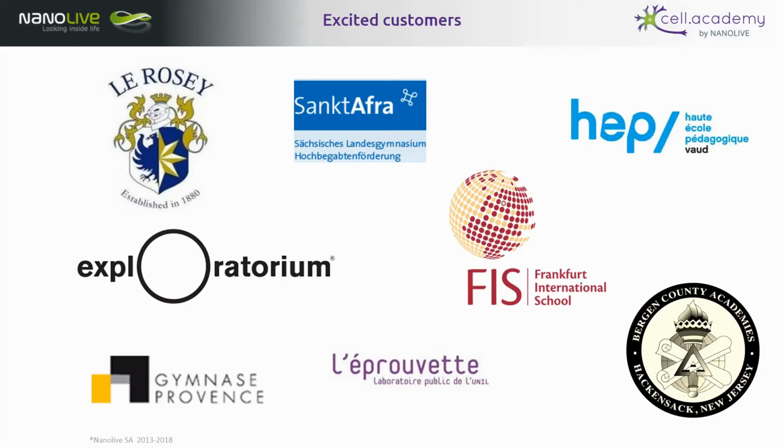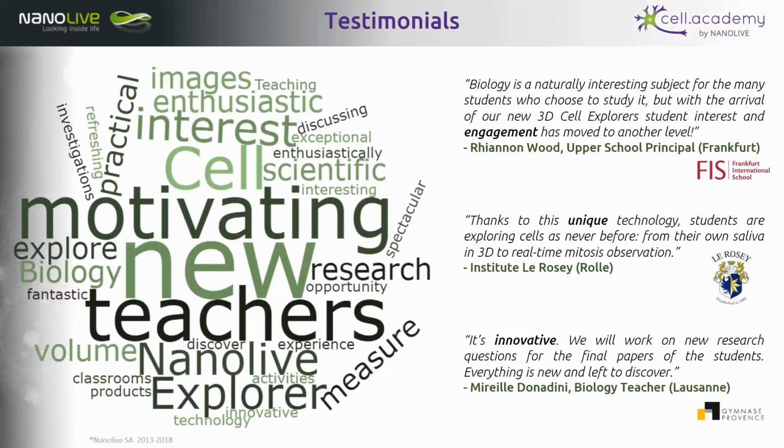So we have various customers in Switzerland, Germany, and the US who've bought this microscope and are really excited by the prospects of this microscope. We have some testimonials, where the same ideas always come up, as you can see. It's about engagement and interest of the students for microscopy, the uniqueness of this technology, and the innovation that it brings. This really proposes new ideas for teachers to motivate the students for cell biology.